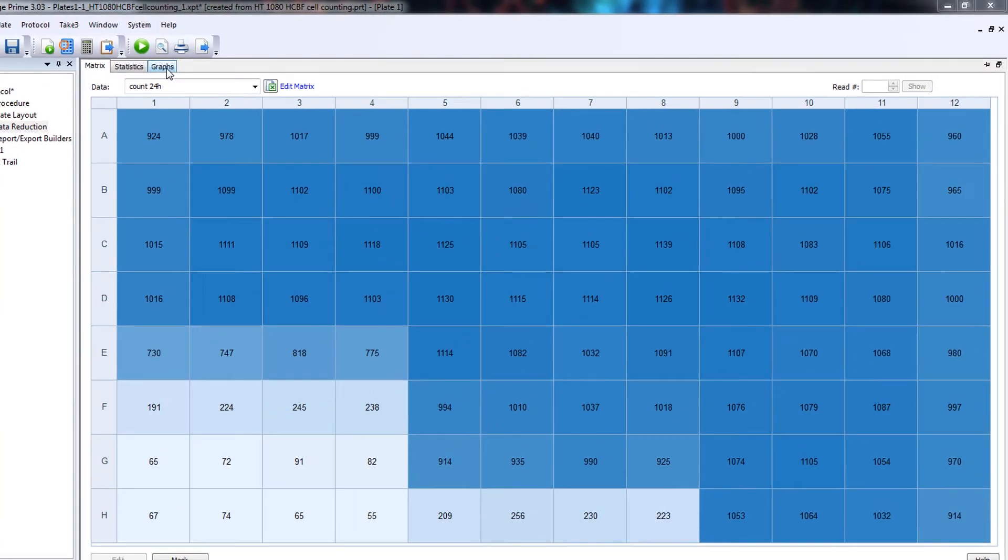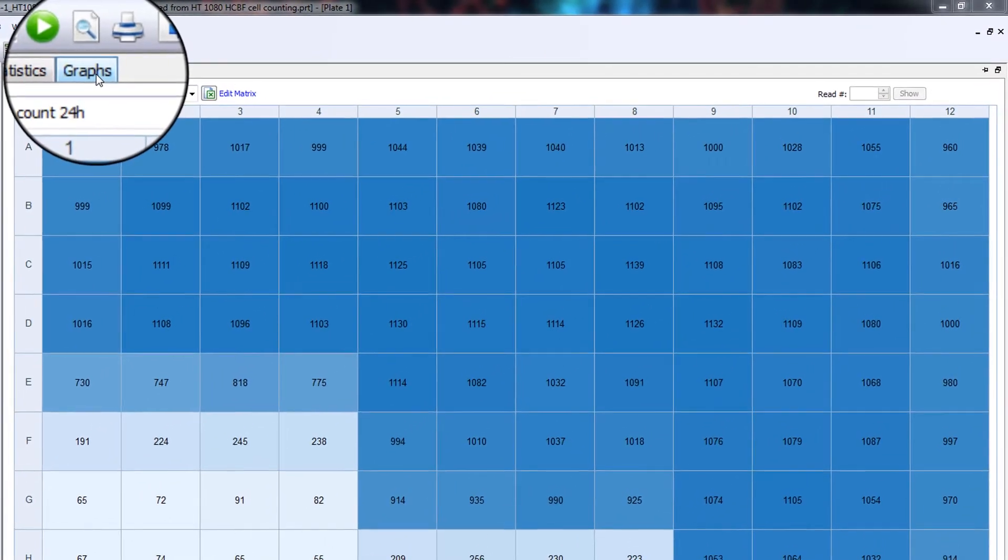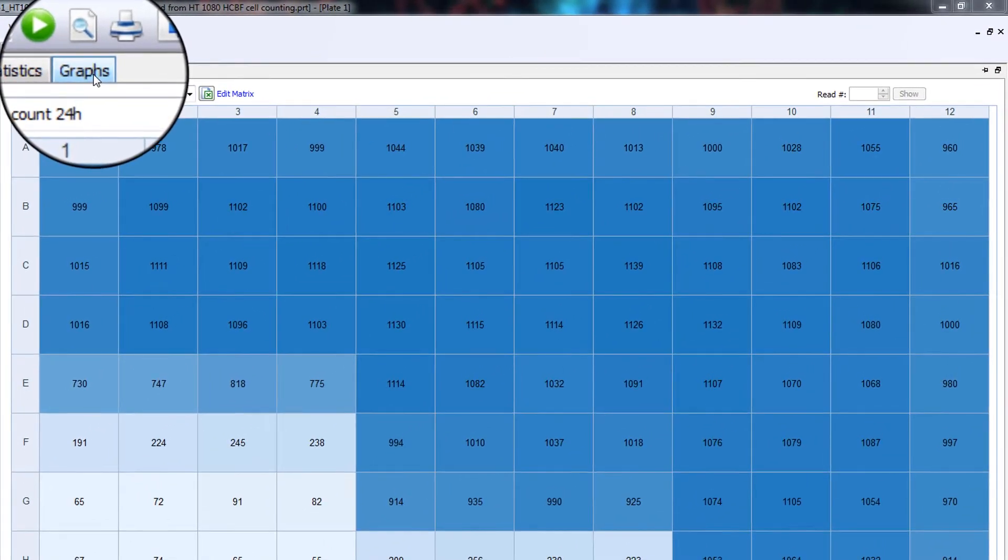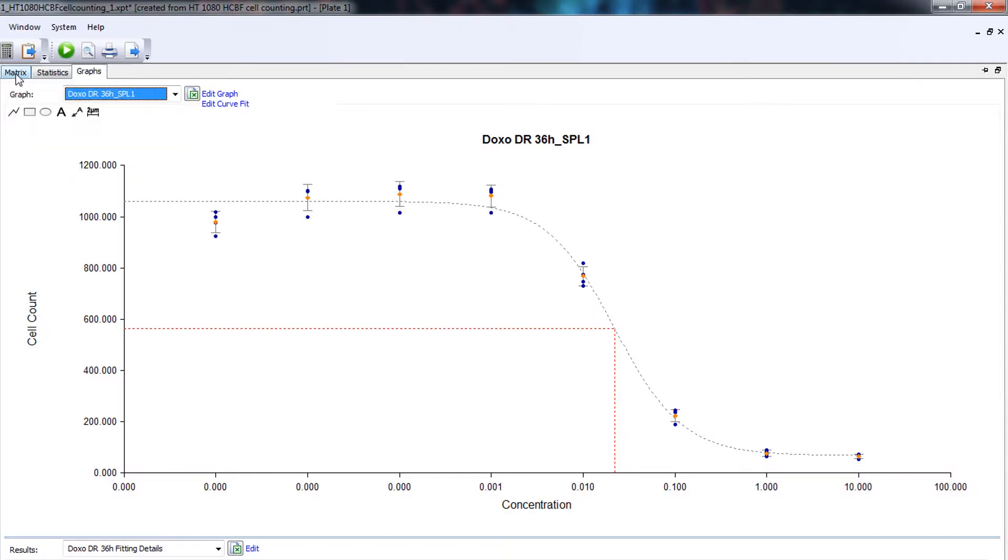Cell count data is graphed in Gen5, ready for the next step in your experiment or for publication.